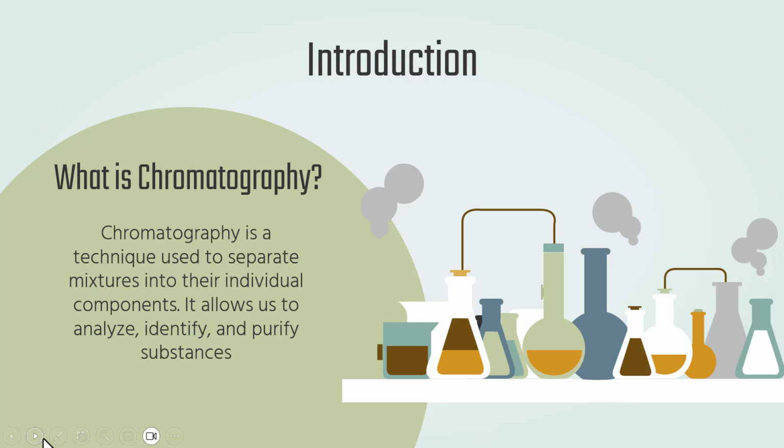So here is our first slide. What is chromatography? In simple terms, chromatography is a method used to separate different components in a mixture. Imagine you have a mixture of different colored dyes. With chromatography, you can separate these colors to see what individual dyes make up the mixture. This technique is super useful in many fields like pharmaceuticals, environmental testing, the food industry, and even forensics. For example, forensic scientists use chromatography to identify substances found at crime scenes.